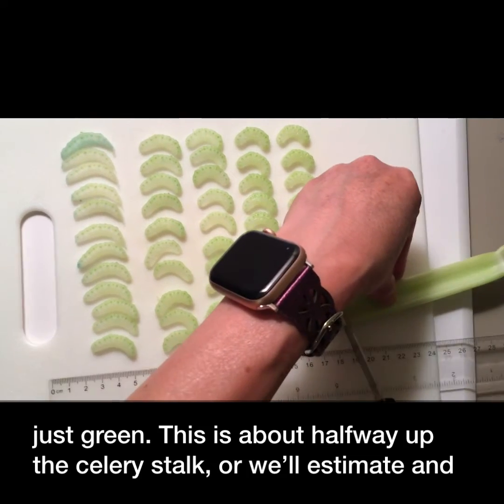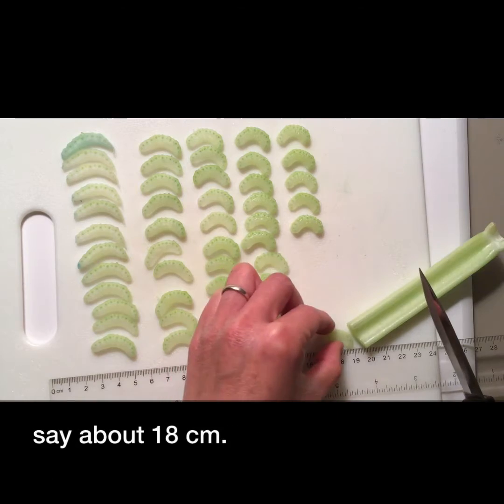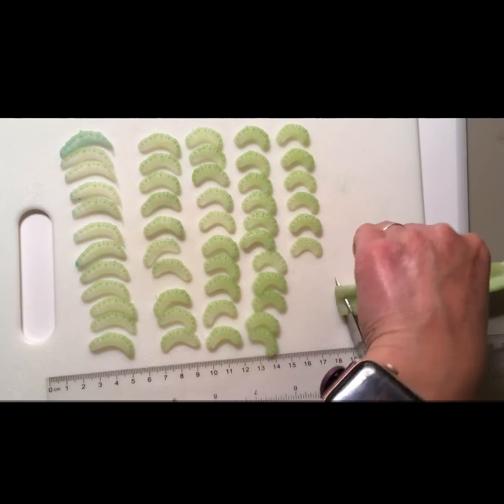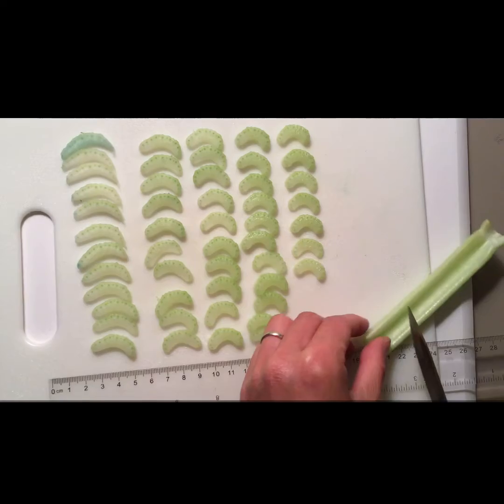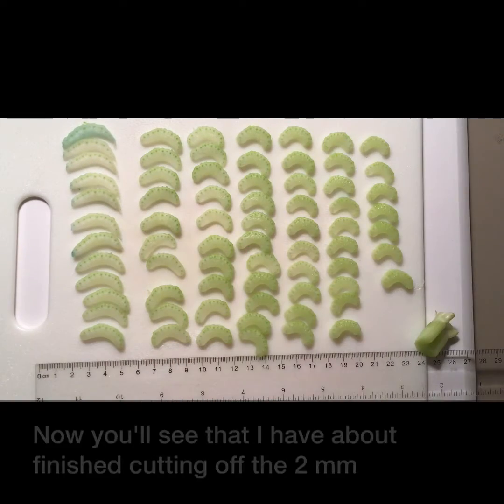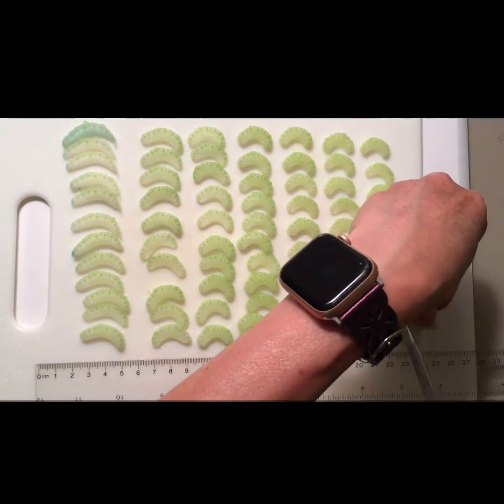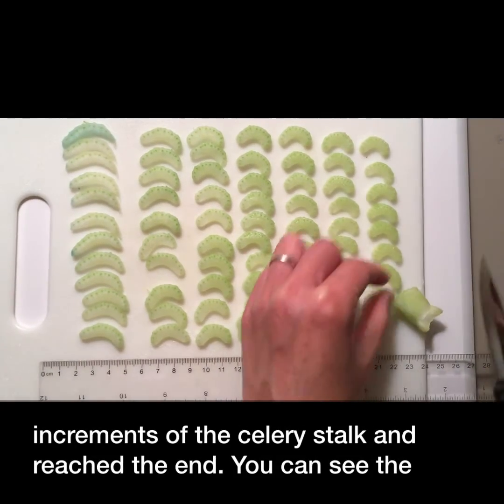This is about halfway up the celery stalk, or we'll estimate about 18 centimeters. You'll see that I've about finished cutting off the two millimeter increments of the celery stalk and reached the end.